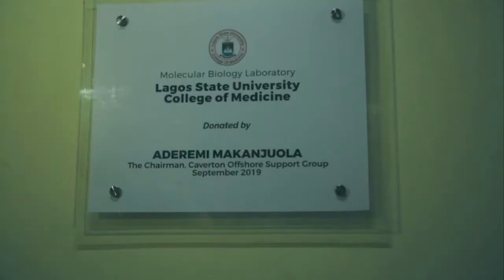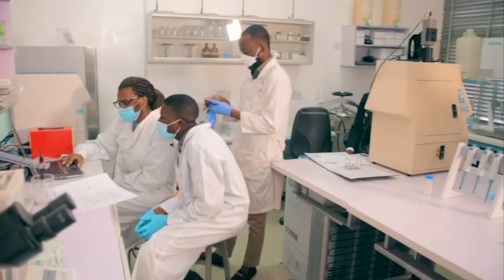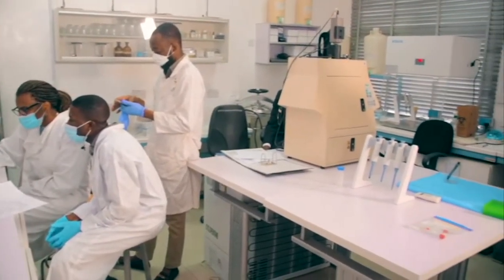My name is Dr. Samira Makanjola, and I'm the coordinator for the Molecular Biology Laboratory. This laboratory was first set up to try and conduct research in the area of molecular biology. So that means work looking at DNA and RNA and proteins. So how do they behave?